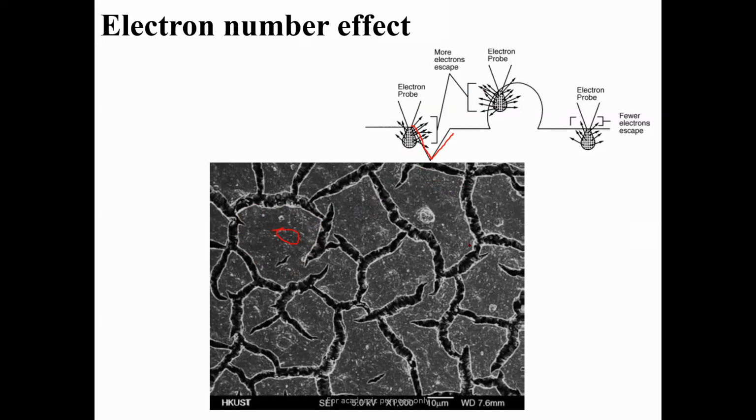So these are telling that there can be a grain boundary or some kind of inclusion. Here also you can see some inclusions, meaning there is a difference in the number of electrons coming out of this surface and these boundaries. So contrast formation in SEM depends upon the number of electrons, from which portion how many electrons are coming. I hope it's making sense.